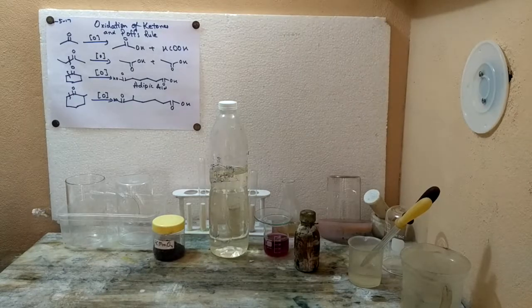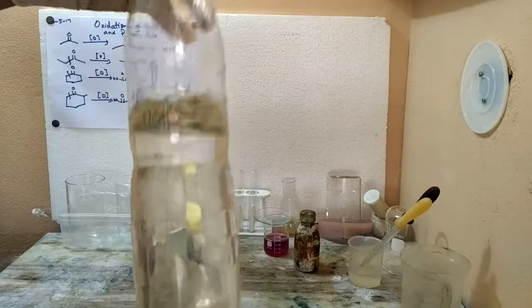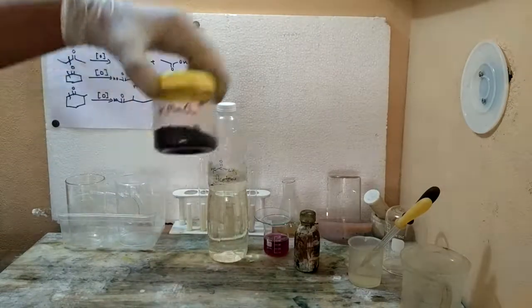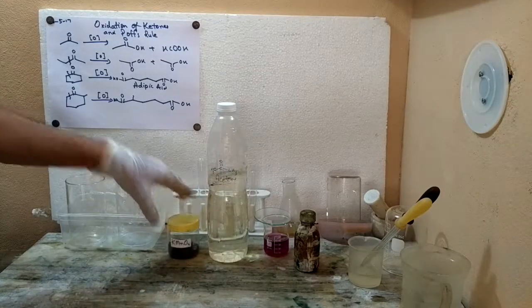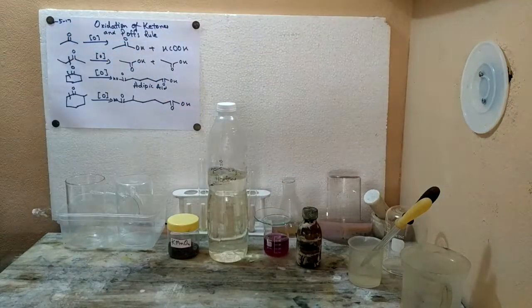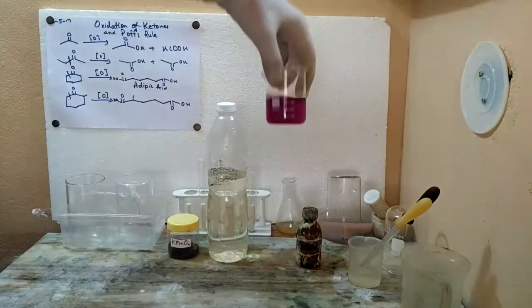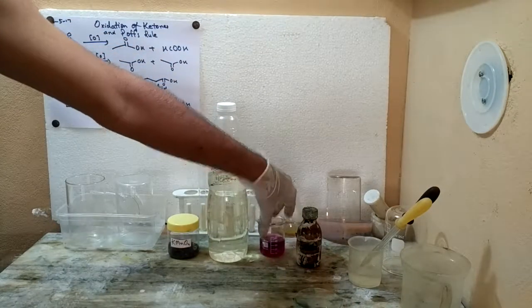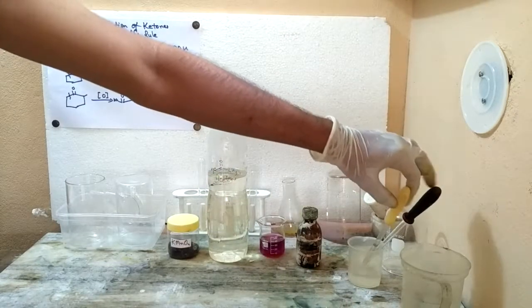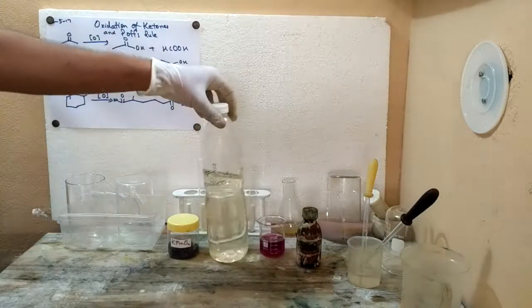All that you need for this demonstration is some acetone, some potassium permanganate, and some sulfuric acid. I've already made a solution of potassium permanganate in water. You also require some droppers, some test tubes, and a Bunsen burner.